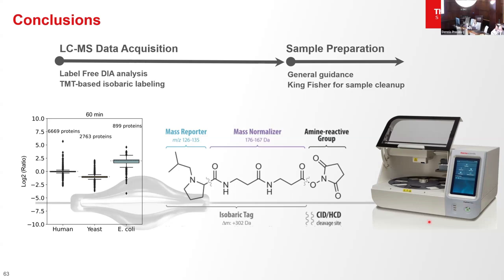Yeah, okay, thank you. So basically you're saying the mass spec does not correlate with Olink. And Olink does not correlate with SomaScan. How about mass spec and SomaScan? Yeah, if you look at a paper published by Josh Coon recently, he compares different technologies for plasma proteomics, and it clearly shows that Olink and other approaches do not have that good overlap, which is good because if you adopt the platforms together, you can answer more questions.